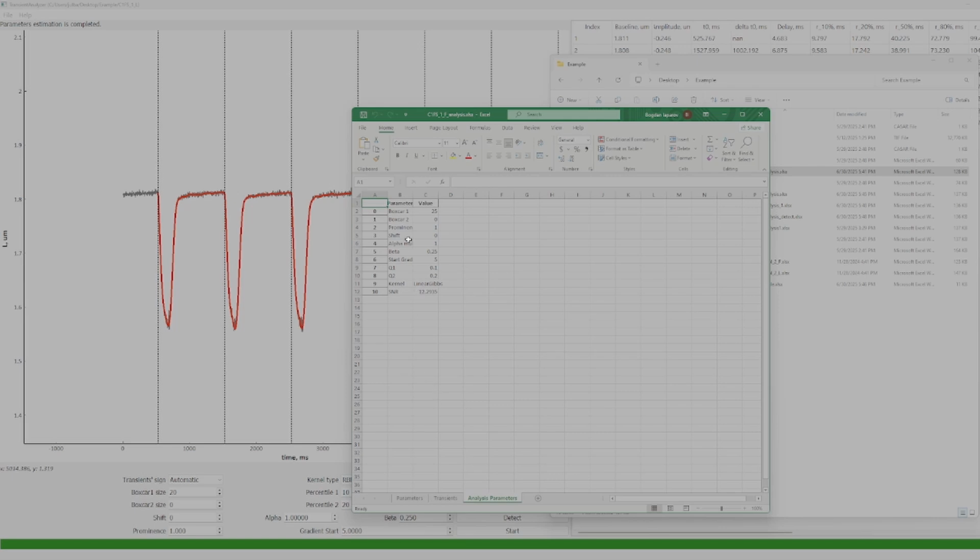If, for example, you would like to repeat your experiment, your analysis, you can just take and use these parameters. And also it's written signal to noise ratio. If it will be too low, we usually don't use such file for statistical analysis, because it has really big error.